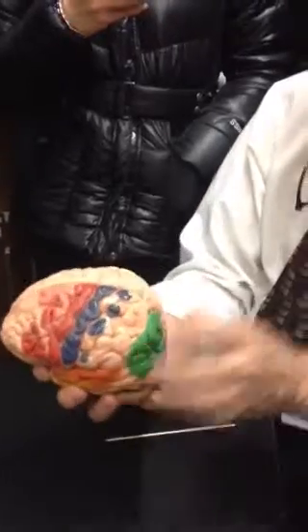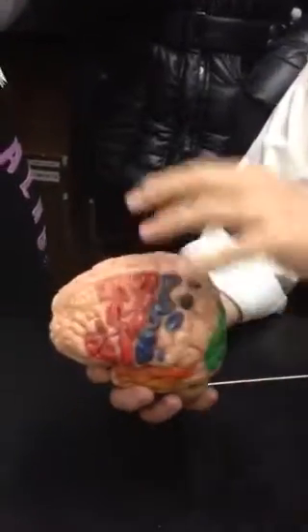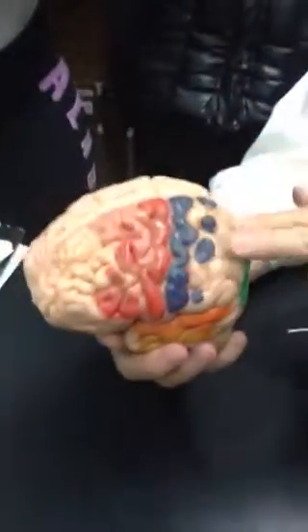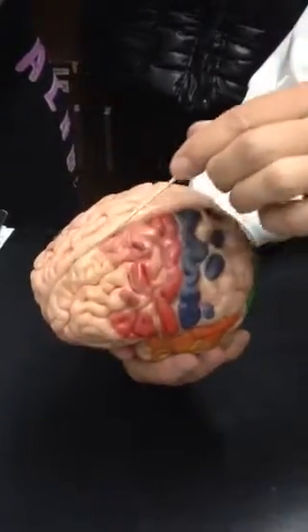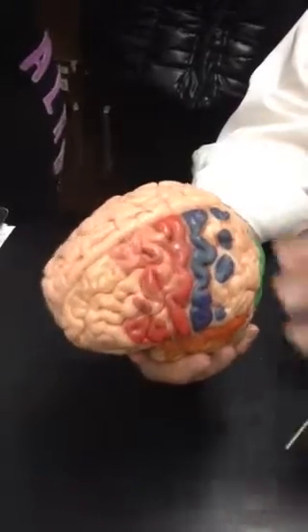Okay, so this is the dissection of the brain. We're going to look at the cerebrum first, only because that's what's visible. The biggest part of the brain is the cerebrum. Again, guys, remember that there's two hemispheres. There's a left hemisphere here and a right hemisphere here. It's separated by the longitudinal fissure. Okay, the longitudinal fissure.